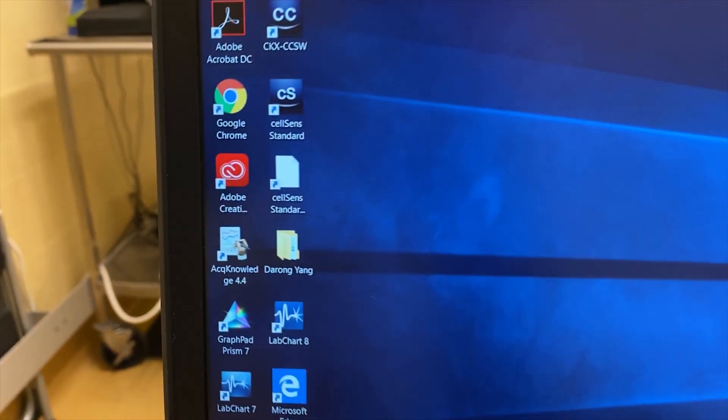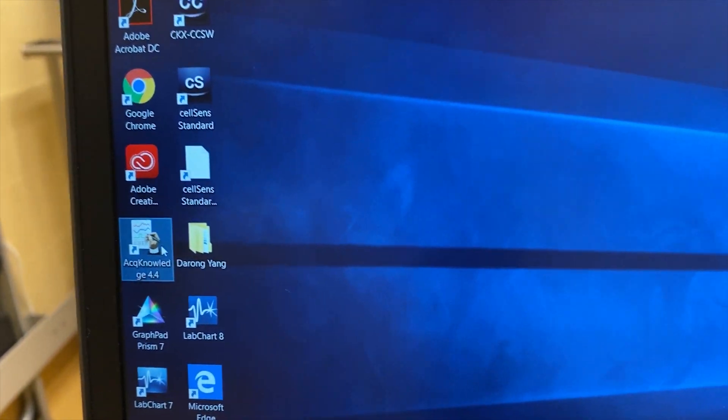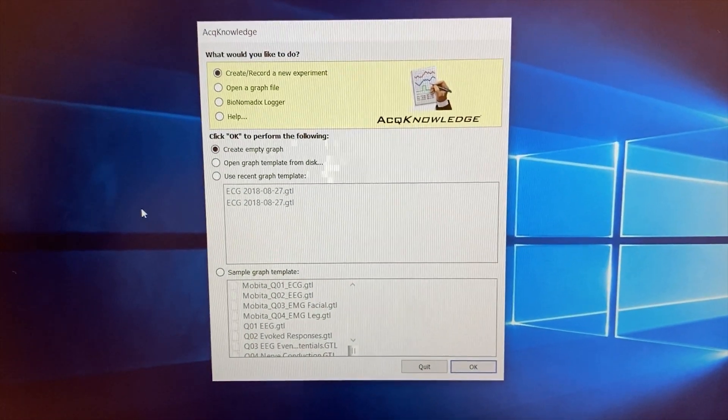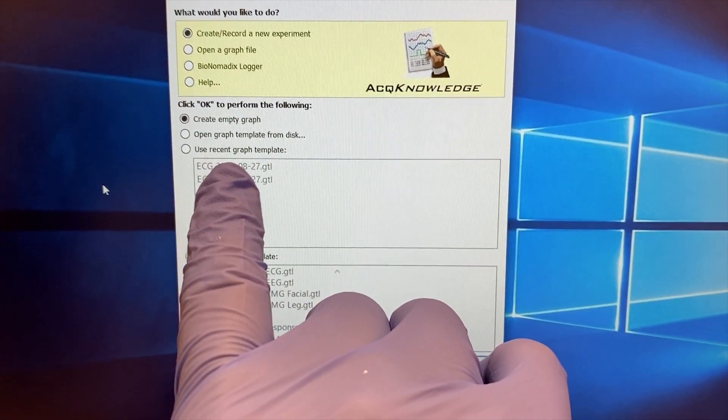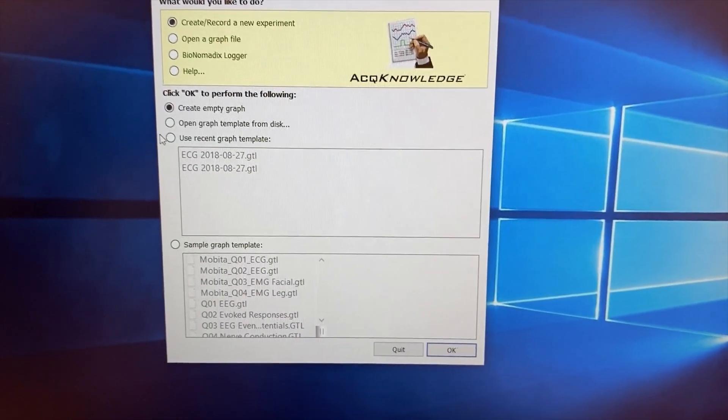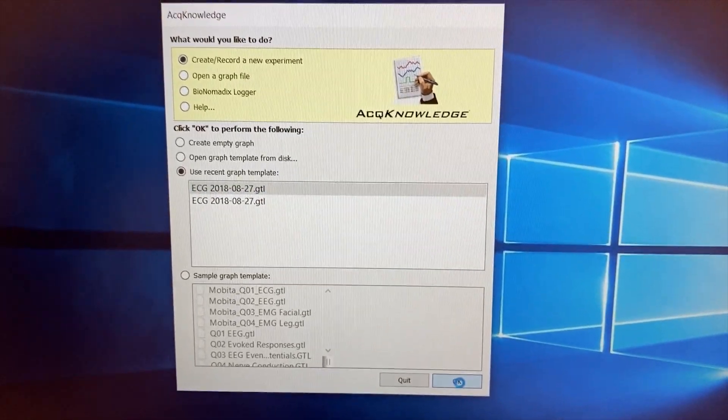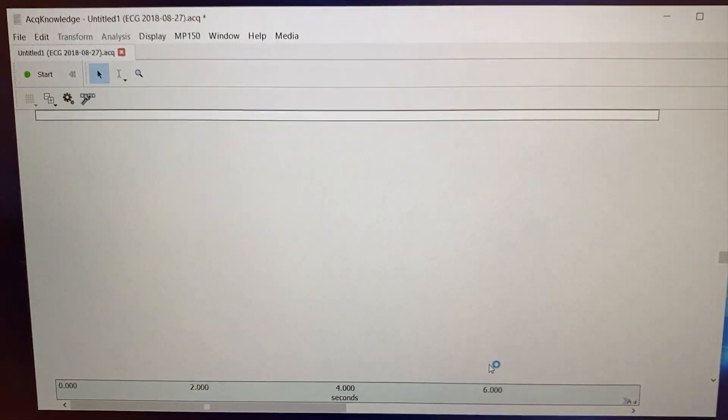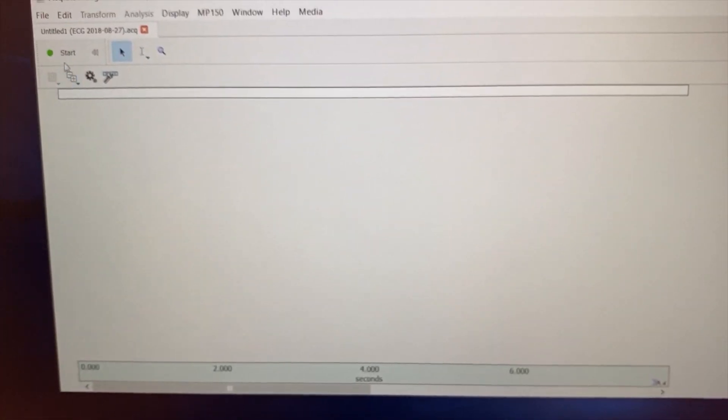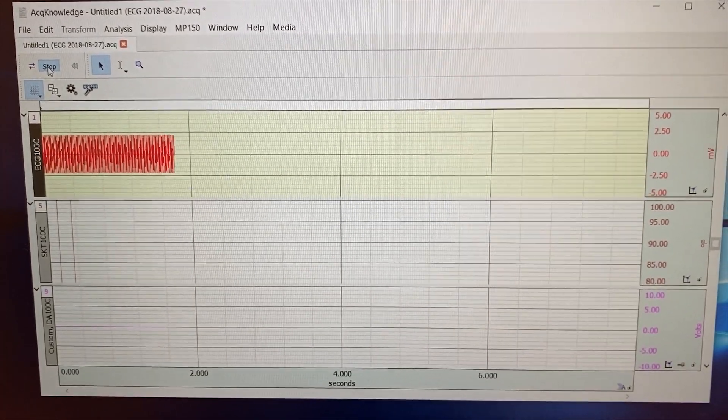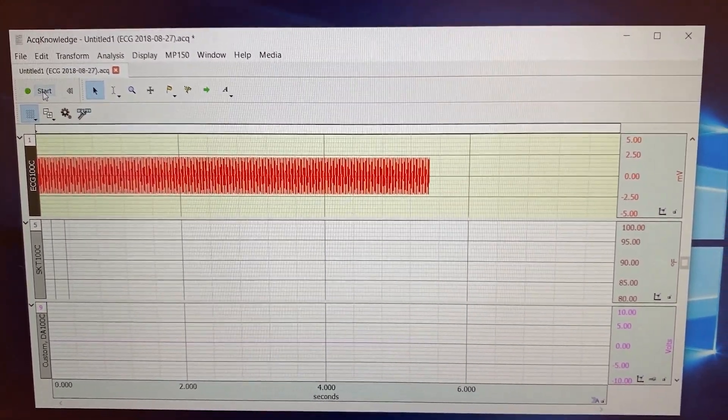In the computer, we will use this software to record the ECG. And most time I will use this template. Select it here. And OK, you will get all the parameters in this software. And you can just use the star to start recording the mouse ECG. And the second click stop.